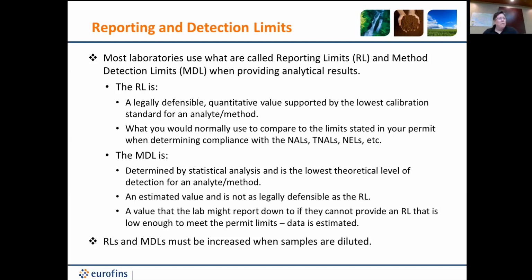And if you do have a contaminated influent source or a midpoint source or even maybe an effluent that's got some breakthrough, if the lab has to dilute a sample for any reason, whether it's the constituent of concern's concentration or it's just the presence of basically junk in your sample, you will see an increase in RLs and MDLs that may take you out of meeting the permit criteria. But all of that stuff is spelled out on a laboratory report.